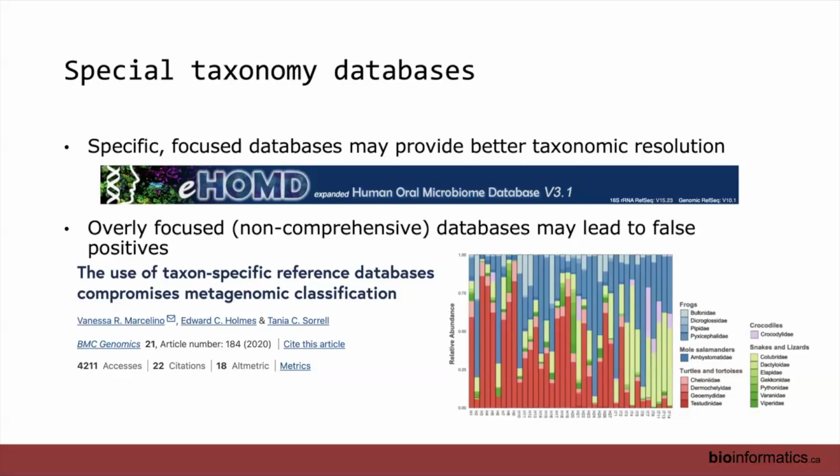It would take too long to do this on all of your sequences, and it's not necessarily the best taxonomic classification that you can get. But because it's a very comprehensive database that you're comparing against, it's a really good sanity check that you're at least getting something similar when you search it against that database, as well as what you've been given from your taxonomic assignment results.